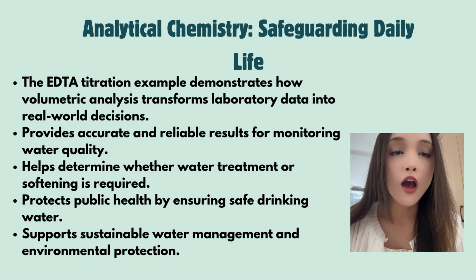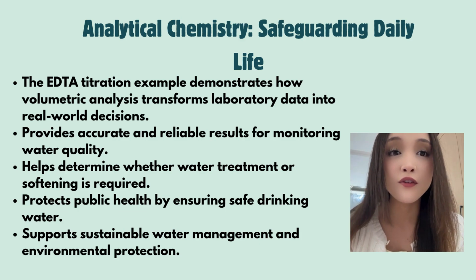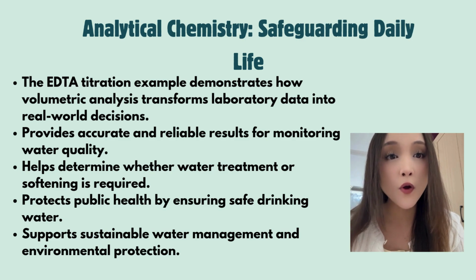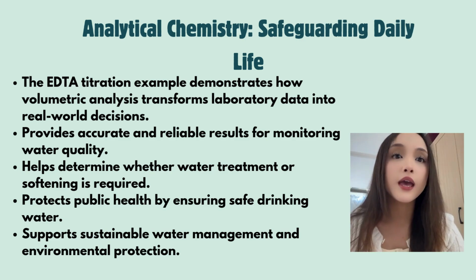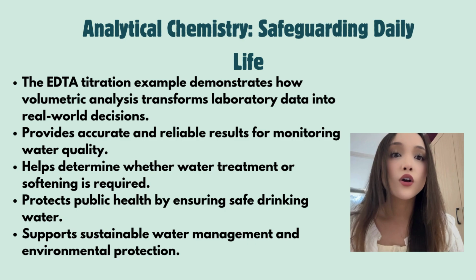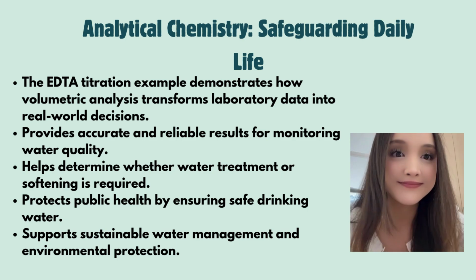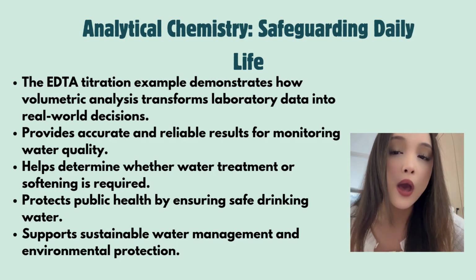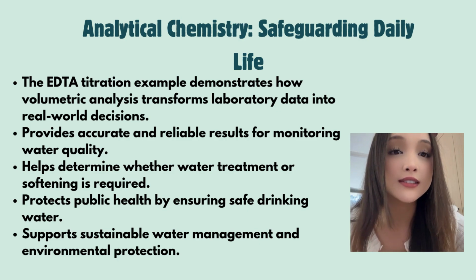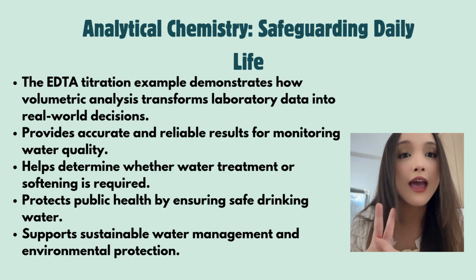The example of EDTA titration clearly shows that volumetric analysis is more than just an experiment. It provides the reliable data needed to make important decisions in water treatment, such as controlling water hardness and maintaining safe drinking water. This demonstrates how analytical chemistry safeguards our everyday life by protecting communities, industry, and the environment.